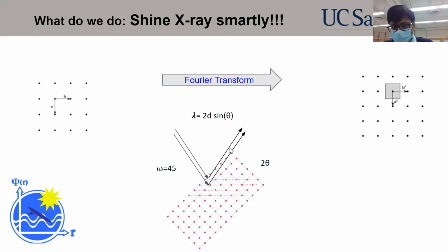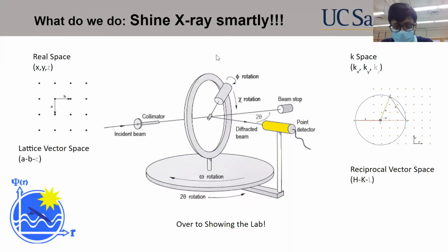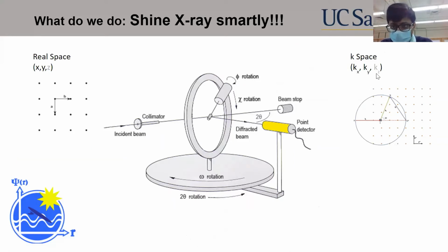And if we map the whole thing in K-space, now I have included the instruments that we use to take the Fourier transform. So things in real space are x, y, z. Things in K-space are kx, ky, kz, where k is 2 pi over lambda. So k is the wave number. If you have a plane wave, a wave of X-rays, you need 3 k values to explain it, right? Mathematically.